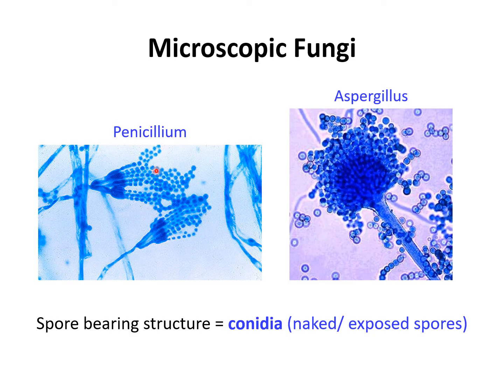Now, this is an example of fungi out there whose spores are not really contained within a sac. So they have their spores like this, naked, basically exposed. This is how penicillium would look like. Again, make sure that you are going to be able to identify if you're given images. So this is how penicillium would look like.